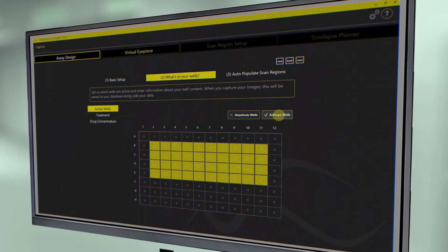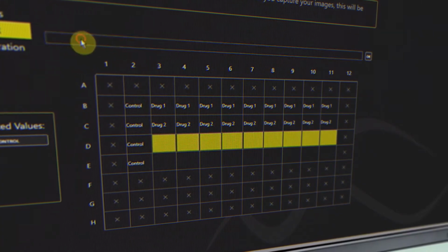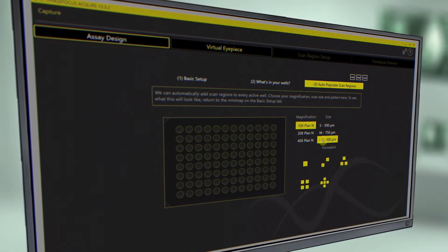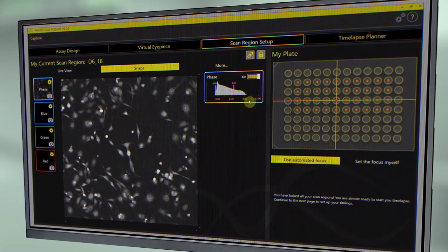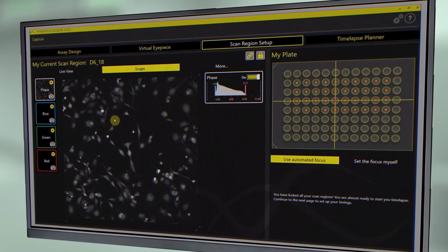Livecyte has a very simple user interface that allows the user to set up a time-lapse experiment right through from defining what's in your wells through to how often you image the cells. It allows you to set up fluorescence channels as well as phase image channels. And this allows you to look at functionally specific behavior as well as the dynamic behavior of the cells themselves.